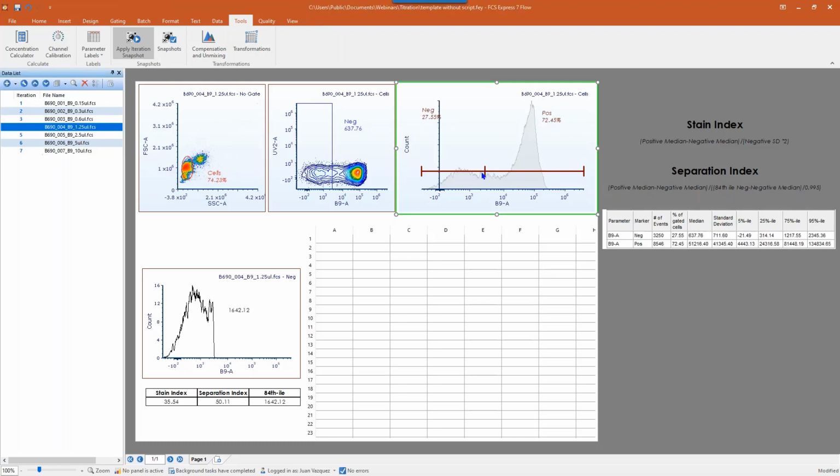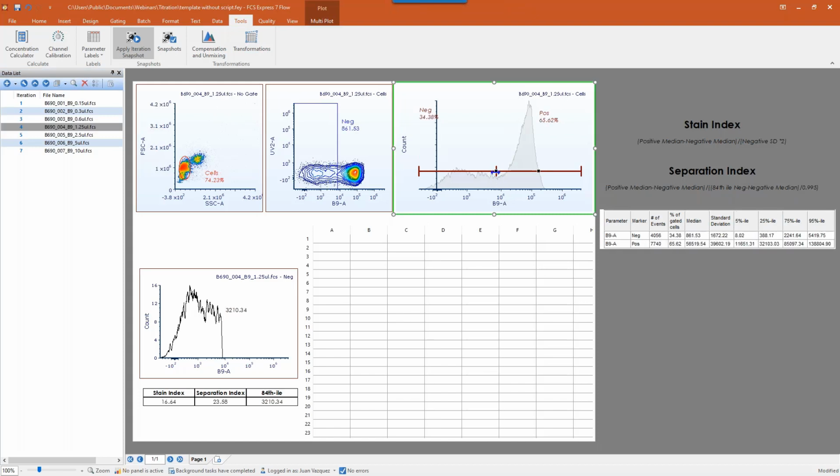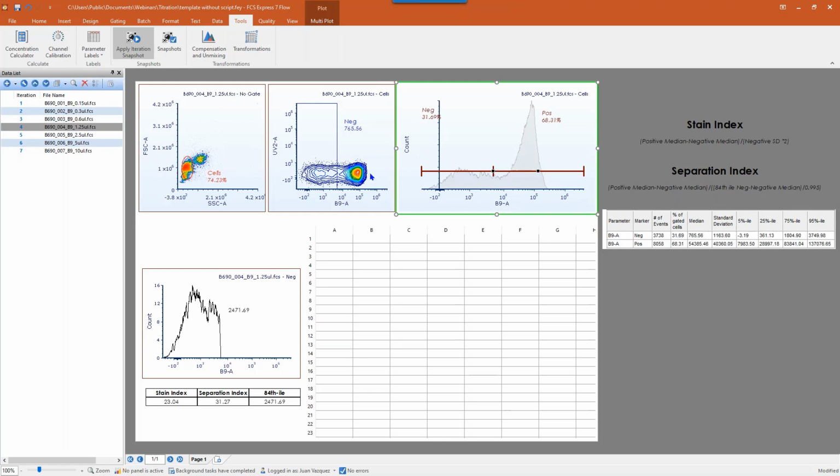Okay. You'll see that there are many different features that can help facilitate this. So we can actually link markers together. We can use contour plots as a way to determine maybe where a value of our data is. I actually like contour plots or density plots as a way to see where the separation of your data is. Histogram can be great, but sometimes it can be somewhat vague as to where your negative starts, where your positive ends.